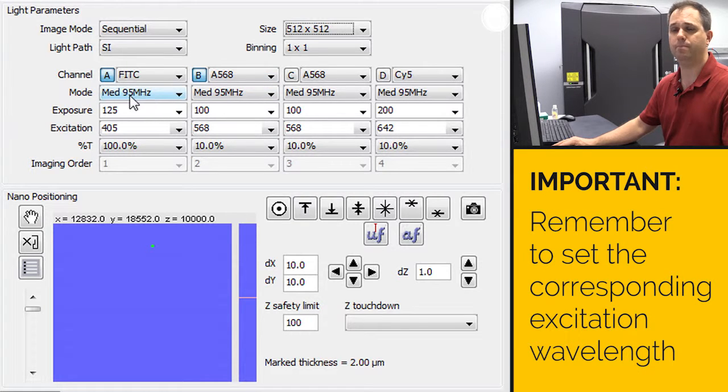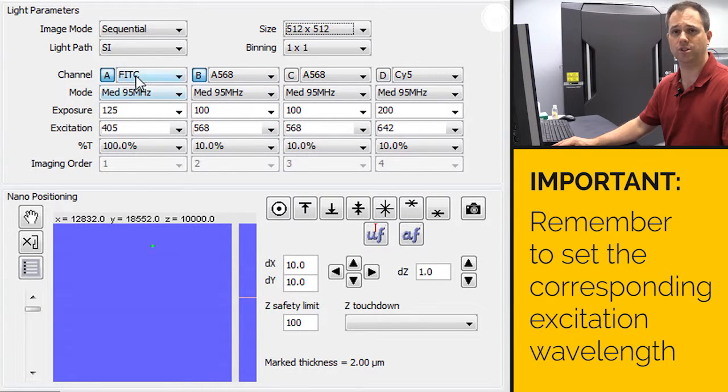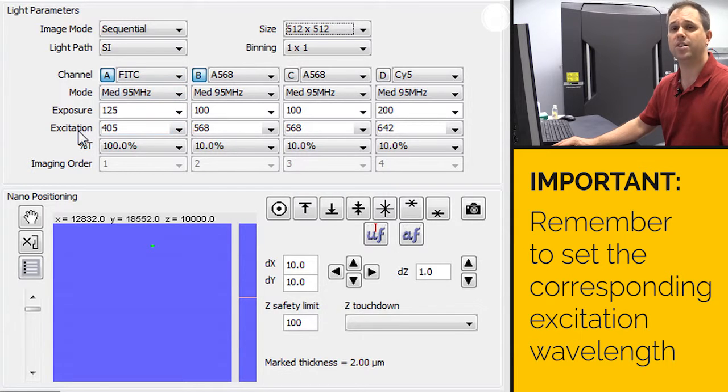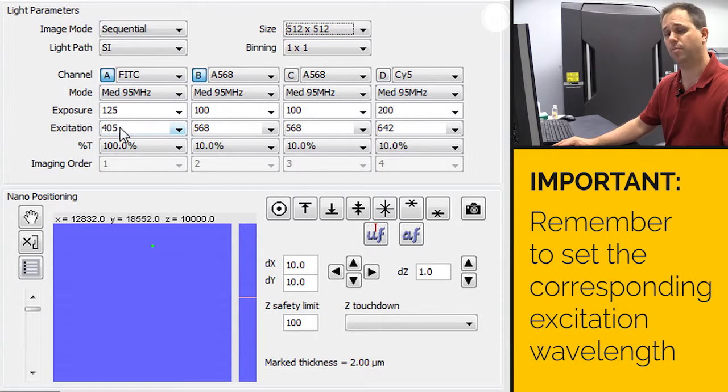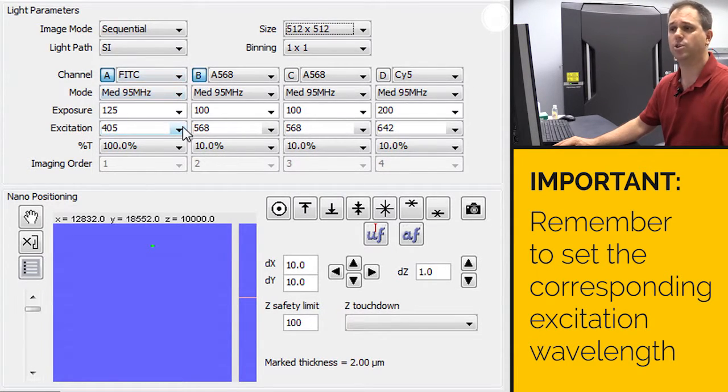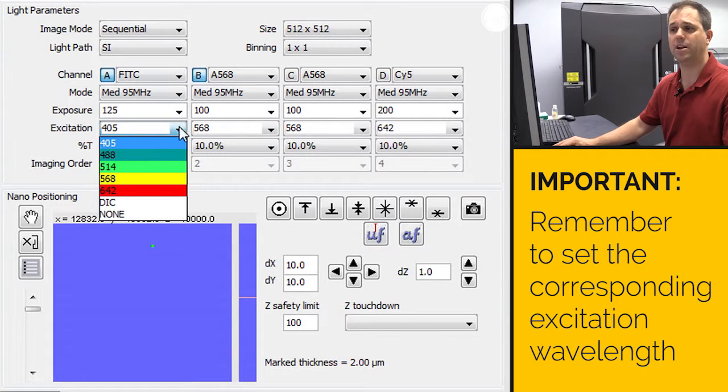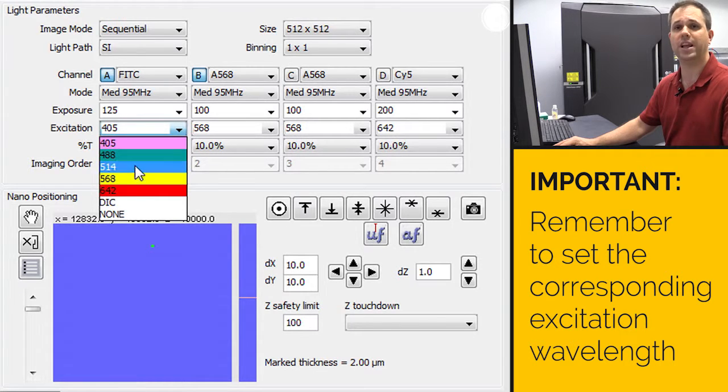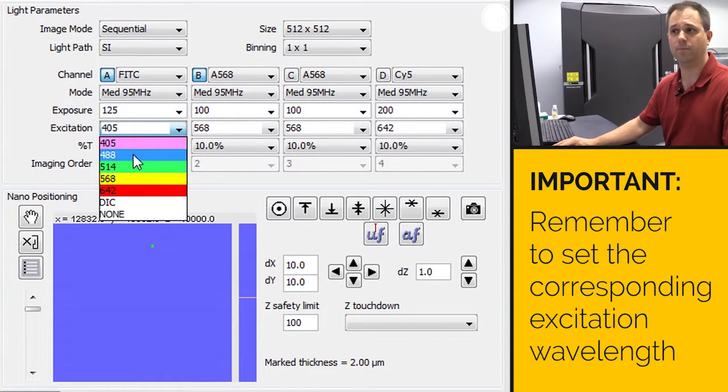Now you want to pay close attention because when you choose the dye in the channel, it does not automatically couple with the excitation or the laser line. So you want to make sure you go down here and choose the appropriate laser line for the color that you've chosen up here.